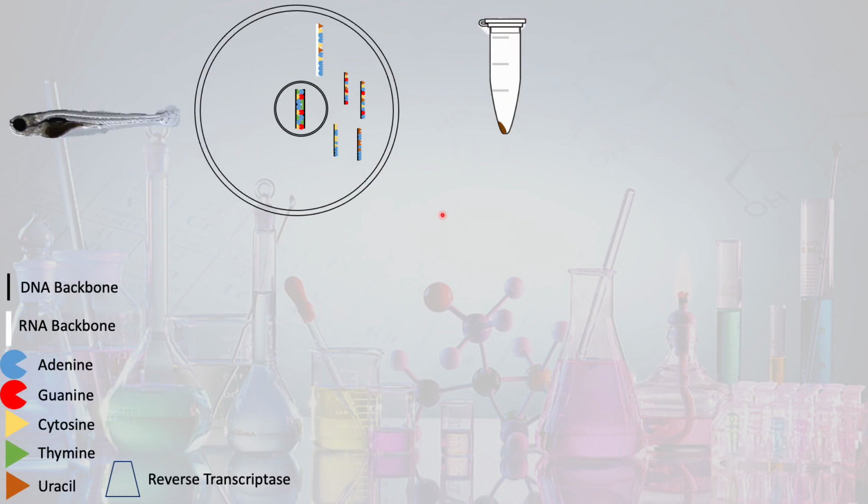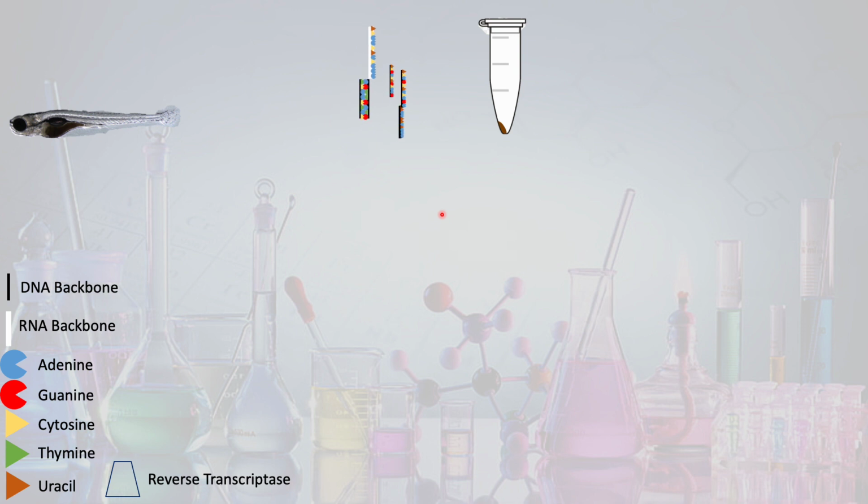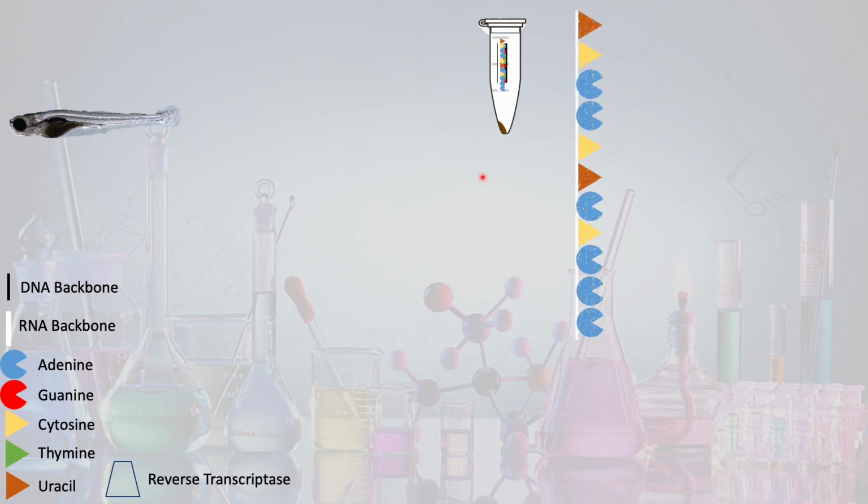So as a reminder from our RT-PCR overview video, right? So last week or previous weeks, we isolated all the RNA and DNA from our samples. So recall that this is mRNA, tRNA, ribosomal RNA, and various other forms of RNA. And ideally, we've excluded all of our genomic DNA, but it's possible that we have a little bit left.